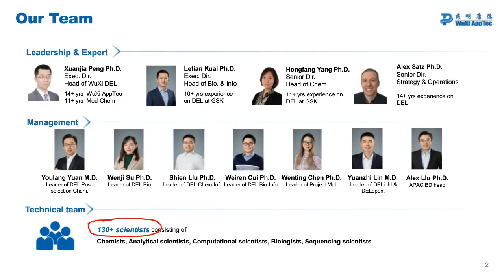Is the protein used full length or truncated? You can use either. Sometimes one gives a result which is better or different than the other, but you have to run the screen in order to find out which that is. If I had to choose one, I would probably go with the truncated version, but it depends what you're looking for. Sometimes you're looking for a binder which perhaps isn't binding in the known active site, and in that case, it might not make sense to screen the truncated version.